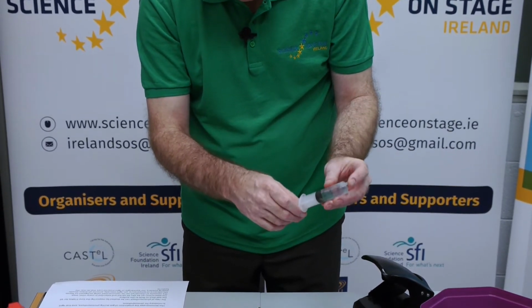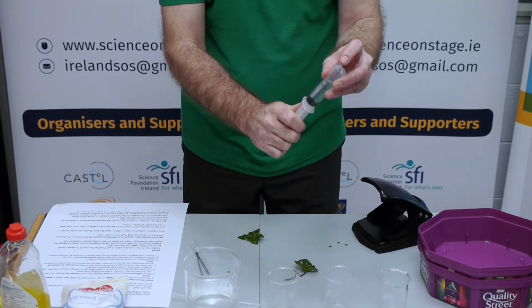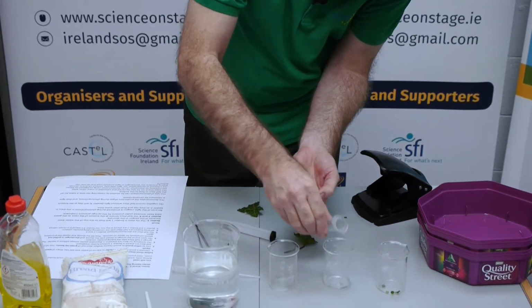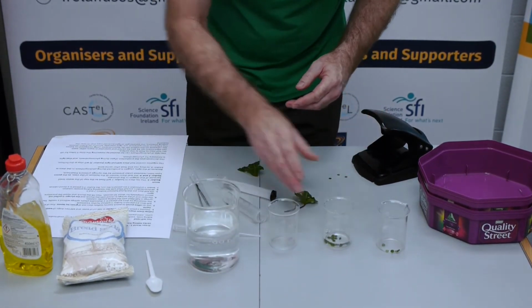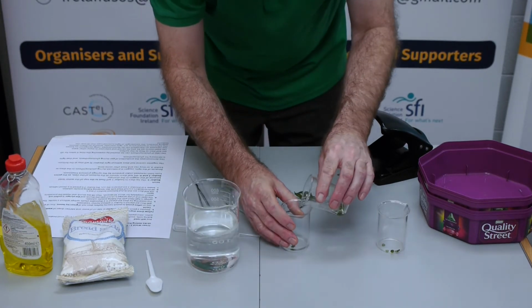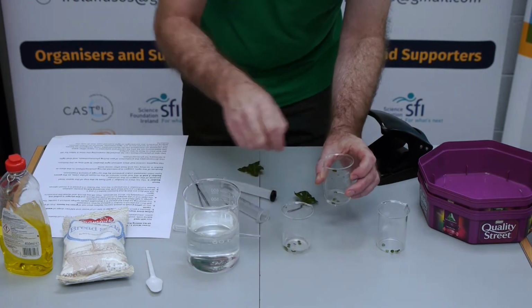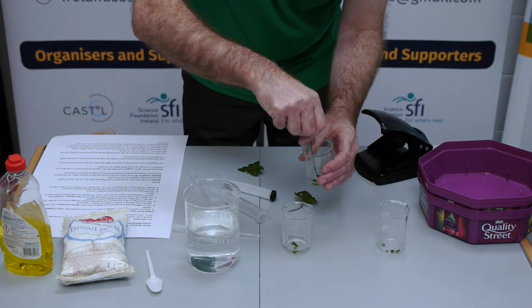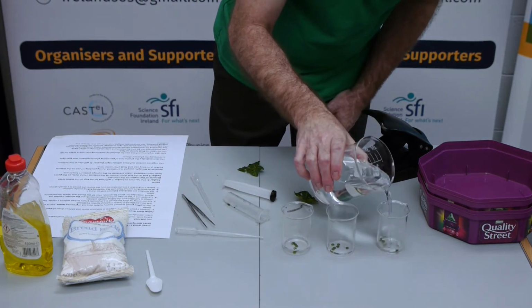So when we then take our plunger out, and get our leaf discs out again, you split these leaf discs evenly between both of your other 2 beakers. Just split them evenly, pretty much. Let's see, we can get another couple in there. Okay, so once you have your leaf discs in your 3 beakers, you can top up each of the beakers with your bicarb solution.